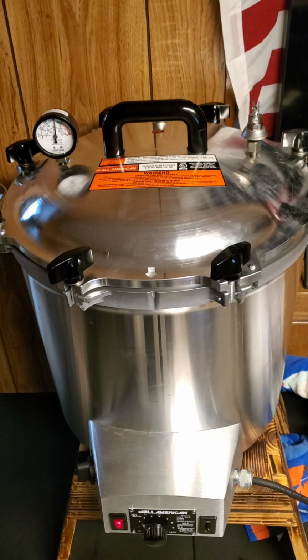I'll shut this baddie off, vent it, and get those out of there. I'll pull that right onto the box and unload them directly into the lab over here in front of the HEPA filter tent, seal them instantly out of the sterilizer, and that'll be a wrap for those. So see you in a bit.